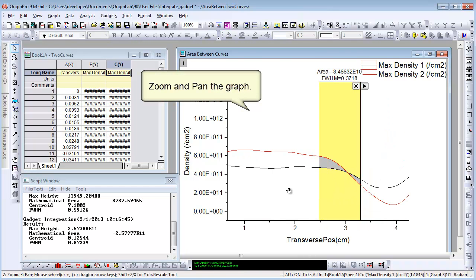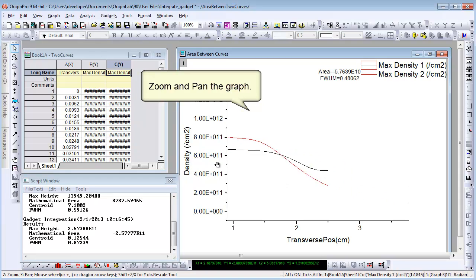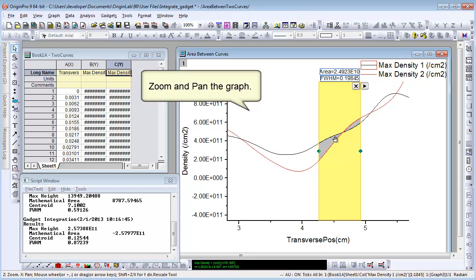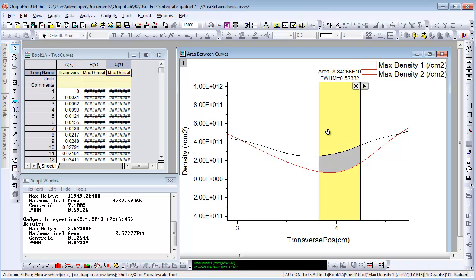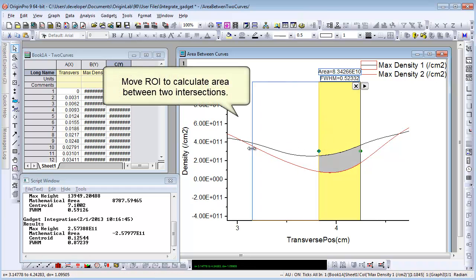To locate the intersections more precisely, you can press Z key and use mouse to zoom and pan the graph. Then you can resize the ROI box more precisely. And you will get a more precise integration result.